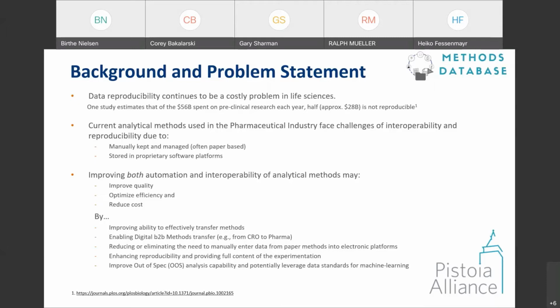And if we can do the same with results, which is actually something that we're working on at the moment, you are now able to carry out some advanced analytics, which you really need for your out-of-spec analysis. Vendors have really only focused on results so far, and it's very important that we do not forget the method parameters as well. The method is developed quite early on in the drug development process, and then this method gets moved around and gets modified, and we really need to document this correctly. So if we have an electronic version of this method, with an ontology and the Allotrope data format platform, we now have a digital standard that we can build on.